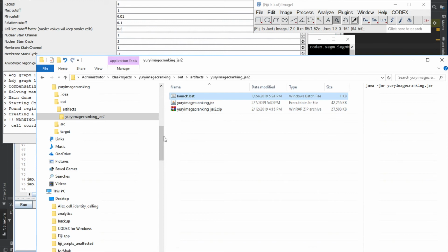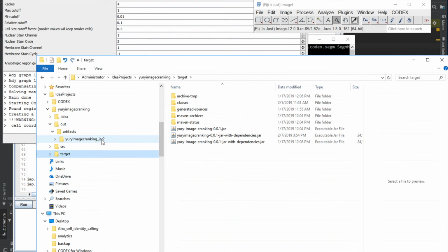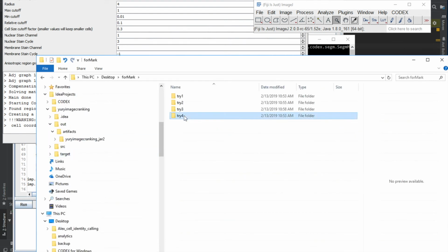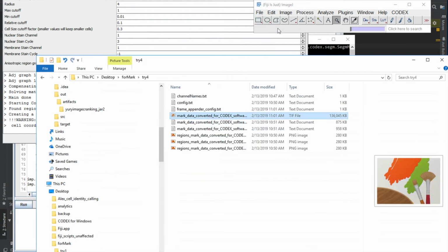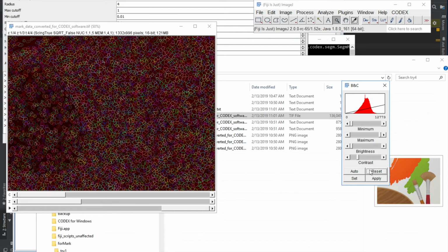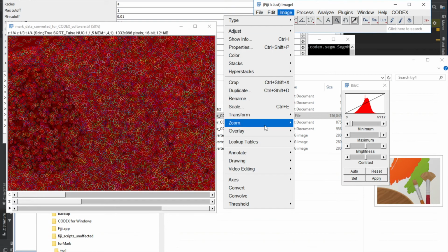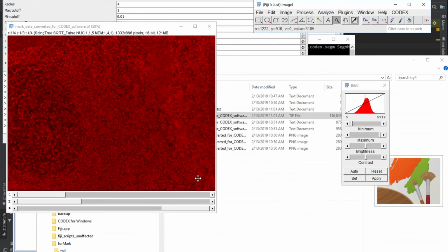All right, it's done. Let's look at how your channel frame number 4 will look. Okay, here we go, frame number 4. And I will remove the overlay because it will be overwritten anyway. Okay, so let's take a look at this.